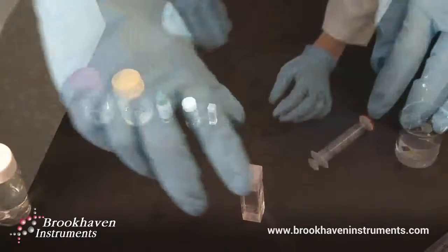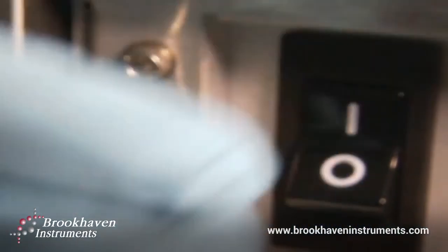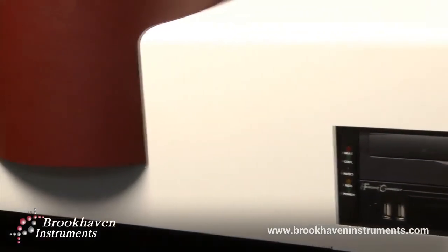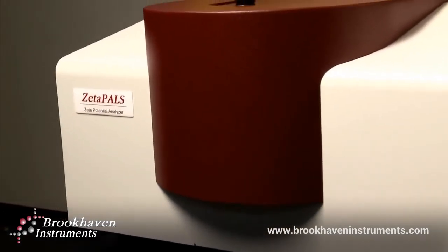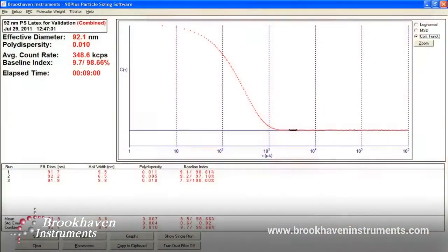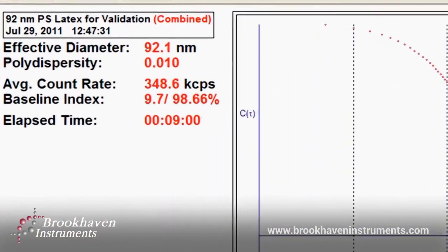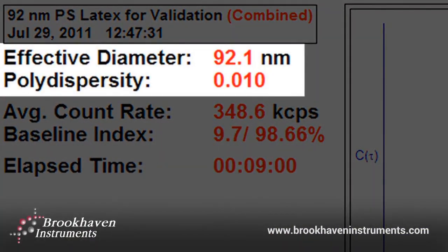Your suspension is almost ready for analysis. Turn the instrument on and start the software, making sure you set 25 degrees centigrade. Place the sample cuvette into your instrument and wait at least five minutes for thermal equilibrium. Please be patient as variations in temperature can yield poor results. Make three three-minute runs. The mean effective diameter should be within 3 nanometers of 92 nanometers and the polydispersity index should be less than or equal to 0.025.